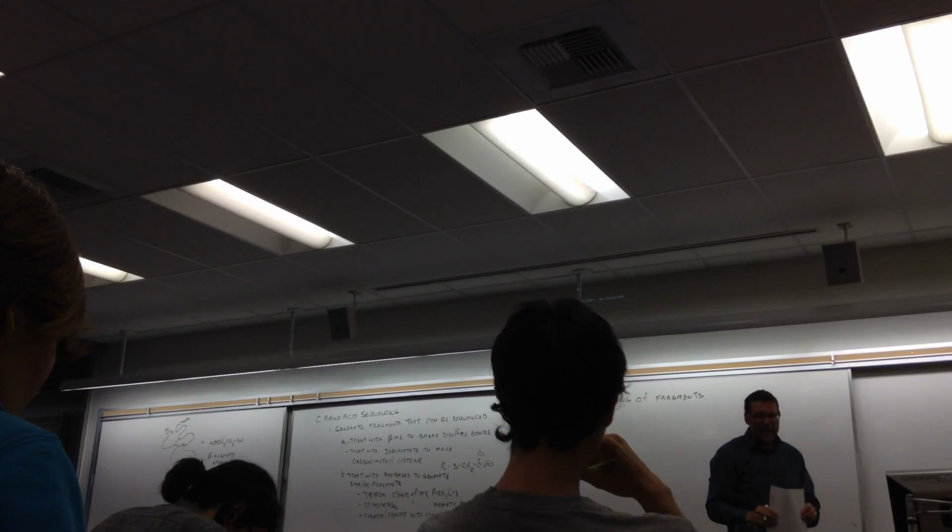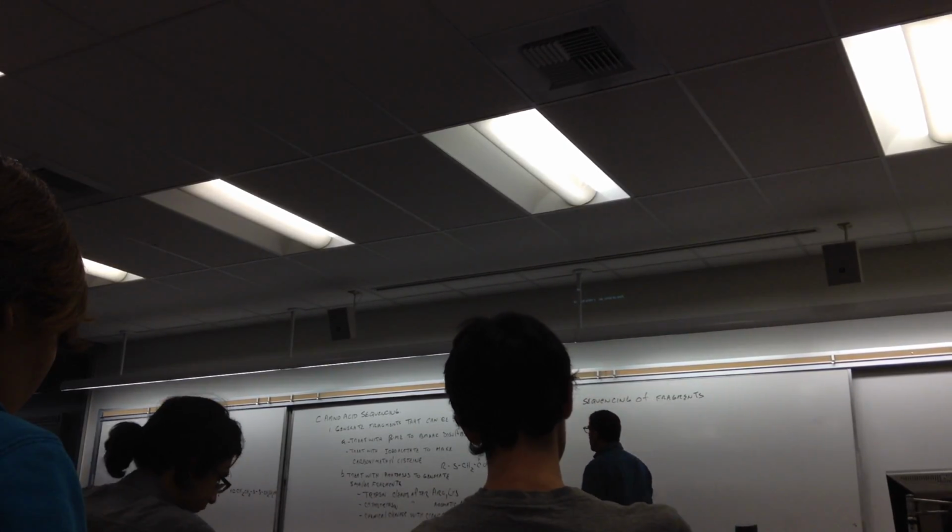The classic technique for sequencing the fragments is the Edman degradation.